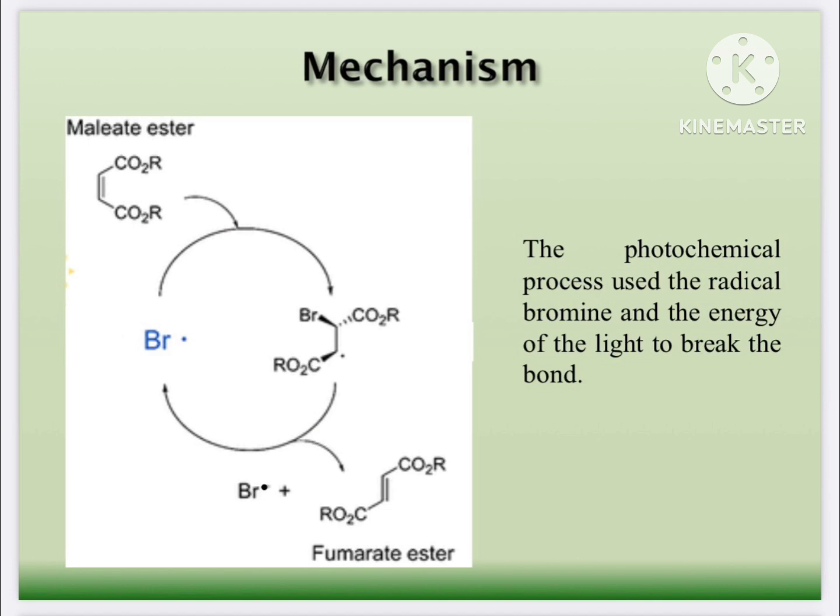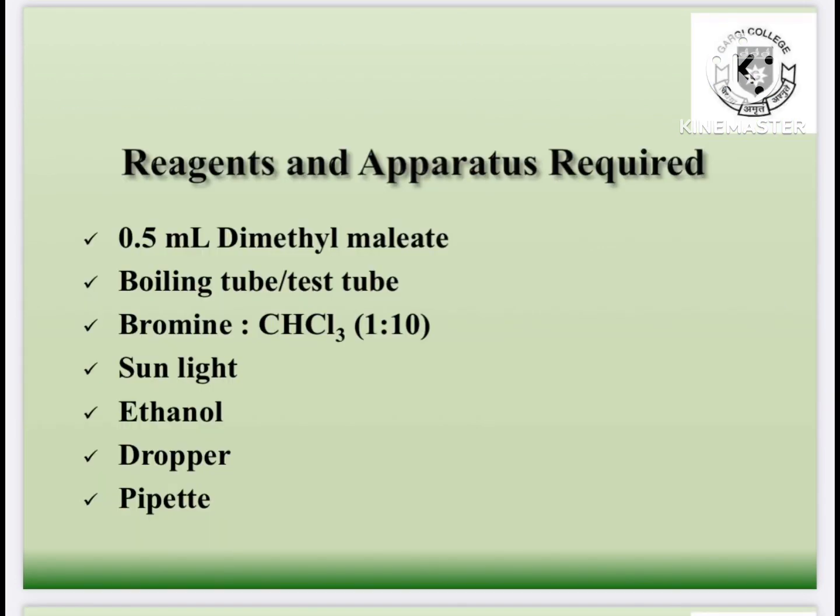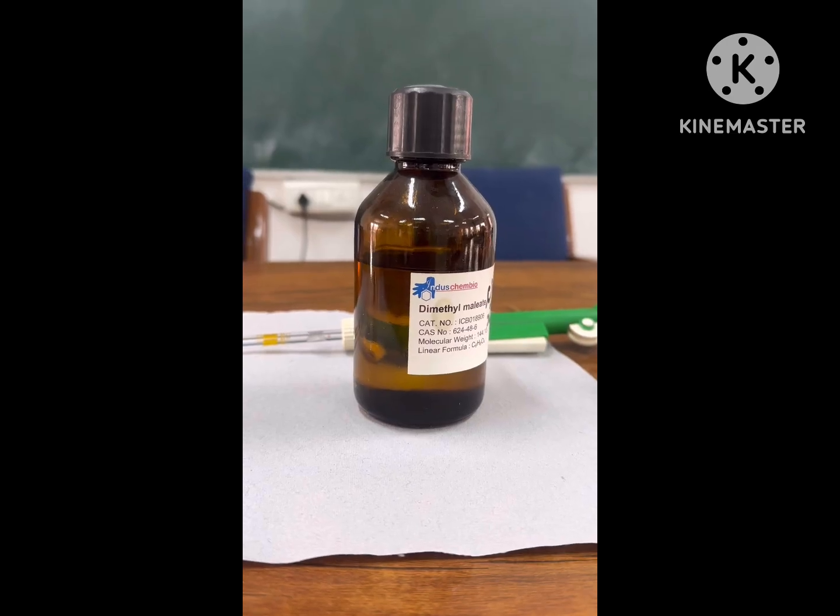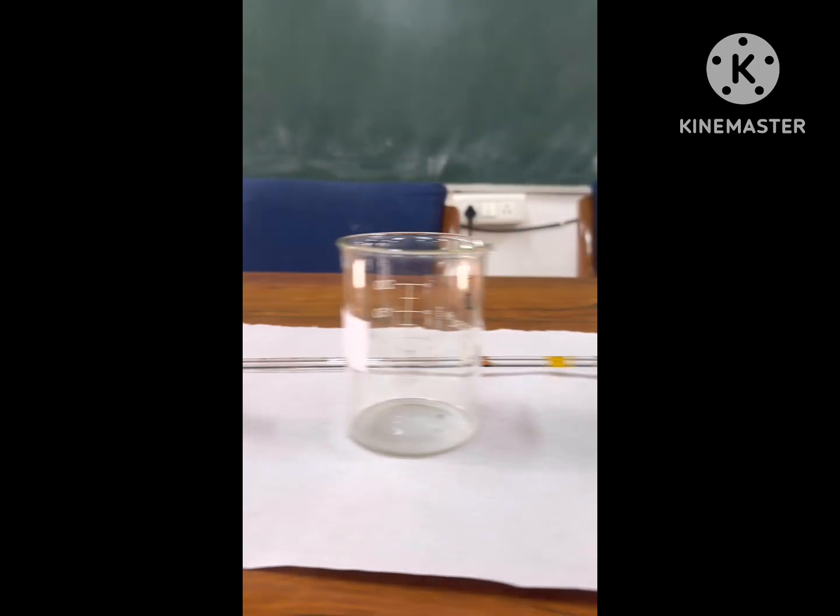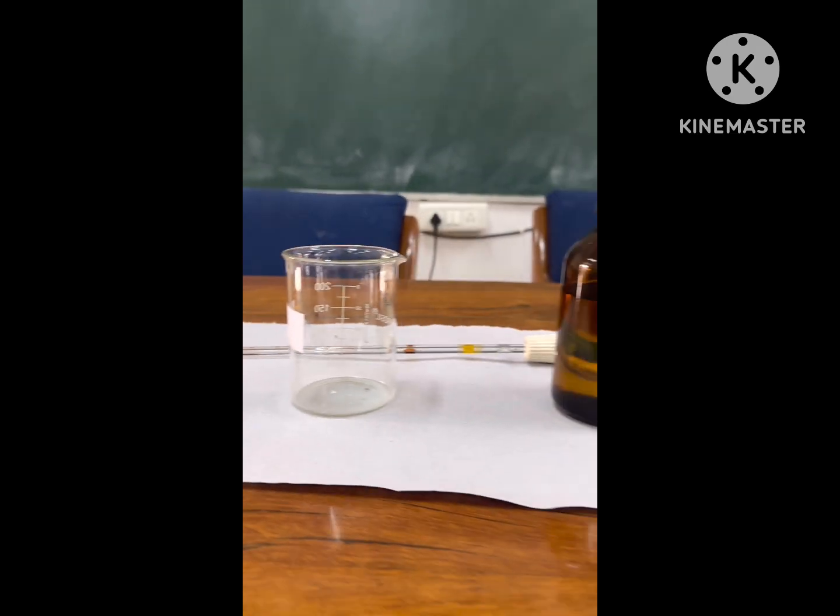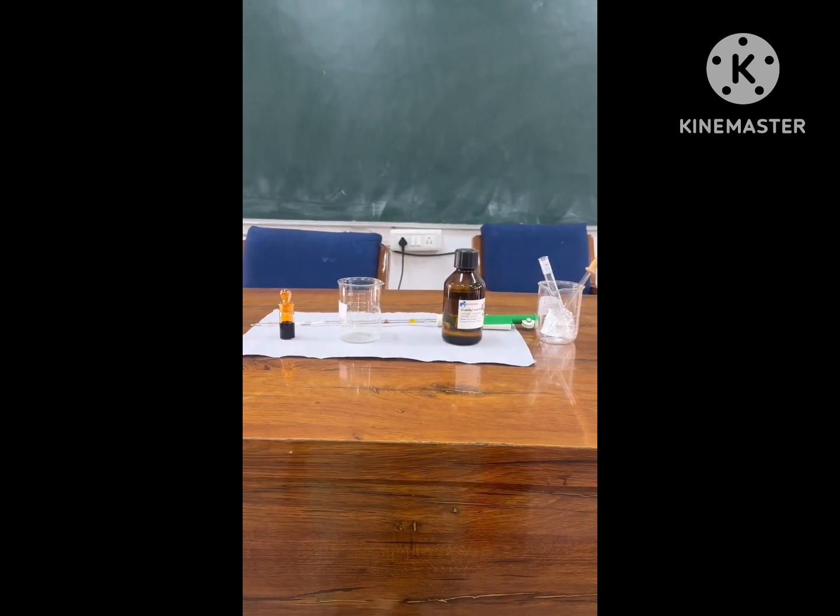For this reaction we require these reagents: 0.5 ml dimethyl maleate, boiling tube or test tube for carrying out the reaction, bromine in chloroform in 1 to 10 ratio, sunlight, ethanol, dropper and pipette. This is the bottle of dimethyl maleate and this is a bromine solution.